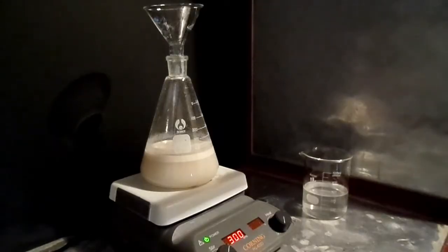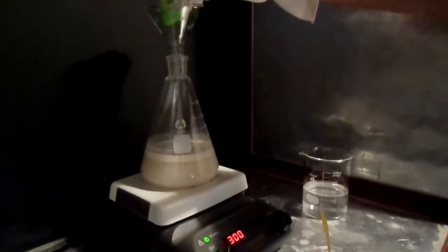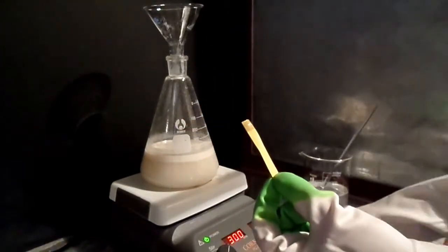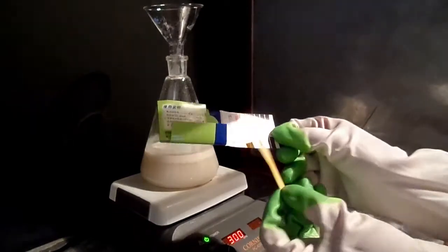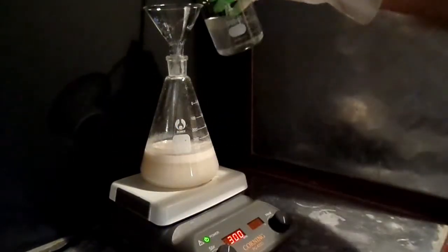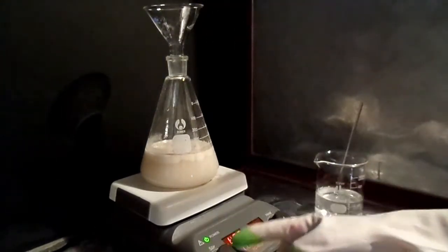Prior to distillation, I wanted to check the pH of the solution, since nitriles undergo hydrolysis in both acidic and basic conditions. Using litmus paper, I tested the pH of the solution and it seemed to be around 6. I added a very small amount of sodium hydroxide solution, but this isn't too necessary as the pH was already so close to neutral.